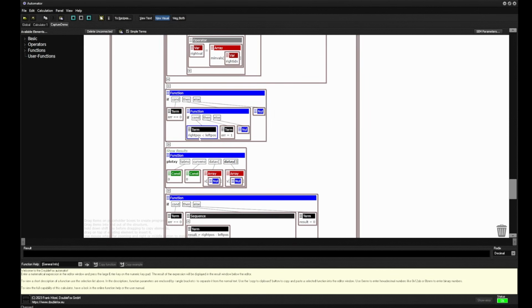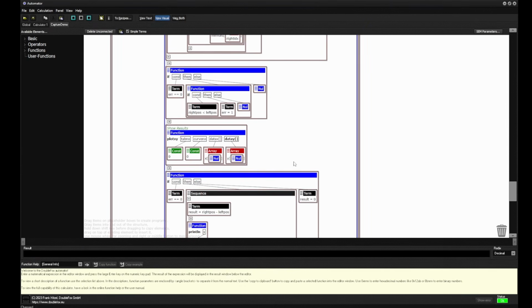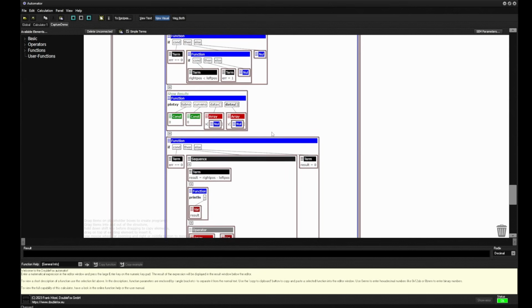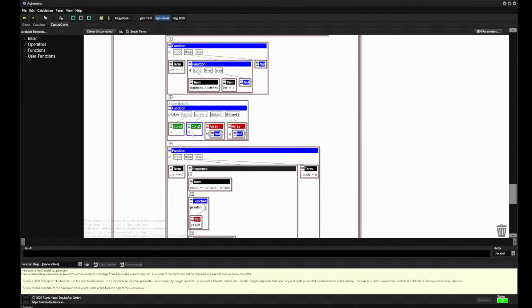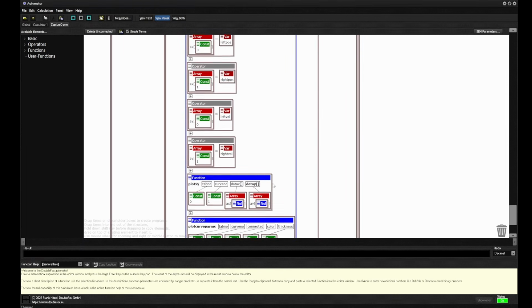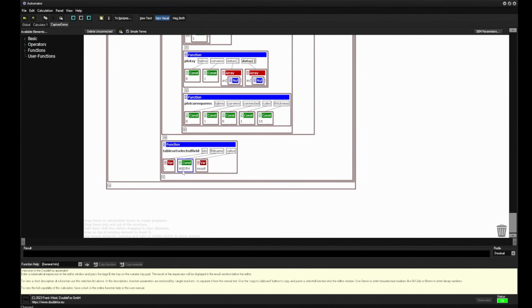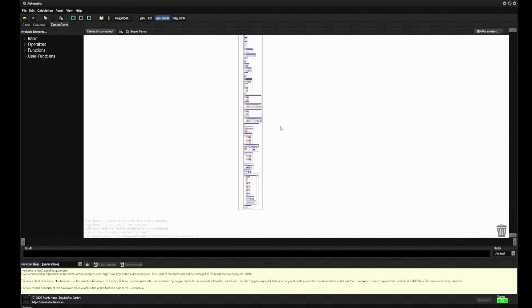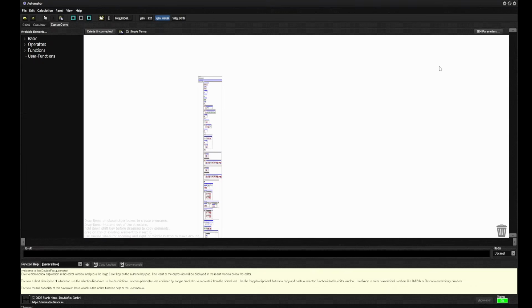And then it checks furthermore whether right is smaller than left. And if yes, then it also sets the error. So the left bar should be smaller on the X scale than the right bar. And then at the end, it plots the results that we have seen and delivers back the result, which is then stored in the column width. So that's the whole workflow in this program.